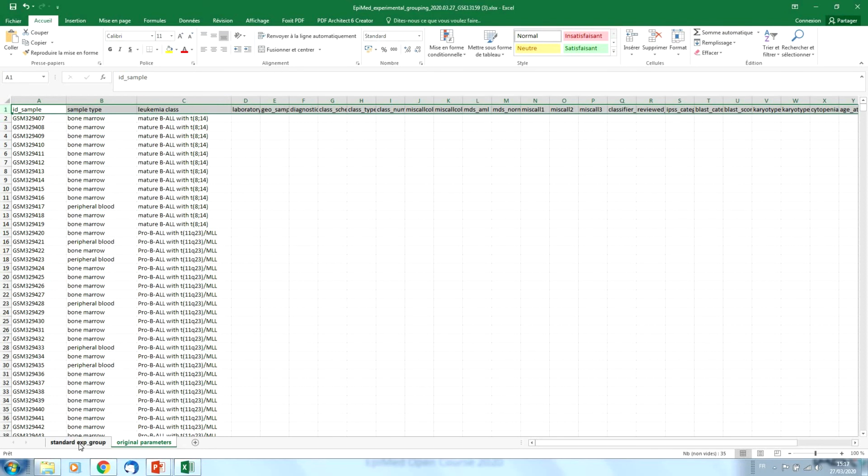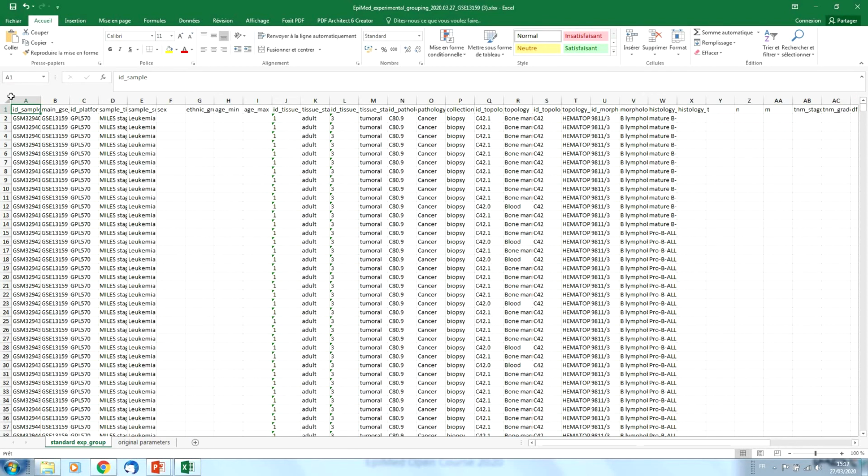If you would like to compare different datasets and different samples, it's not sufficient, and we sometimes need to recognize these original parameters and project them to well-known, established and standard columns that we prefixed for all the datasets. So let's look at these columns.